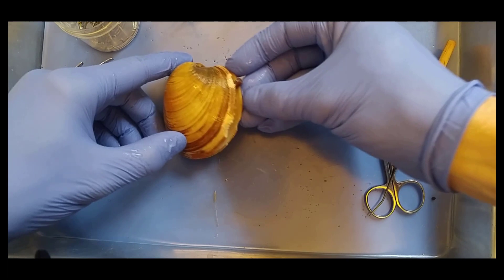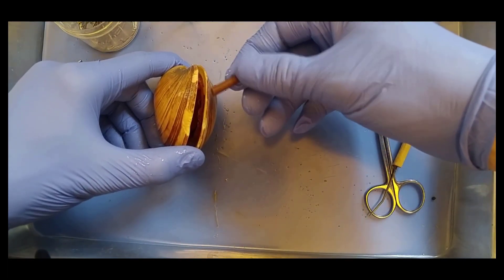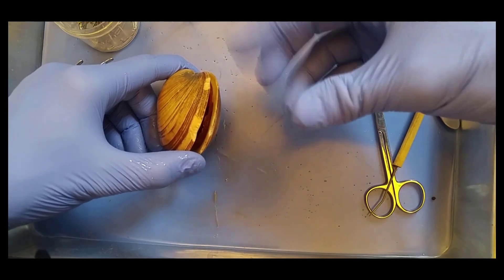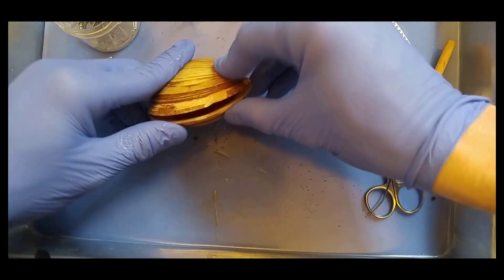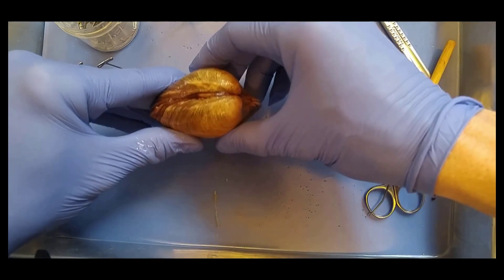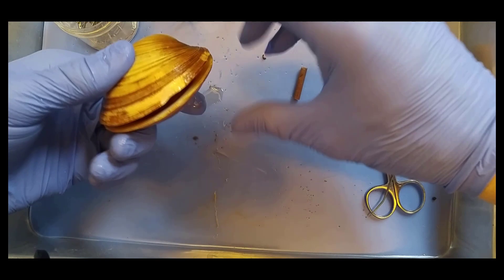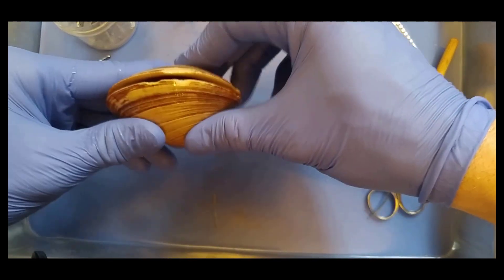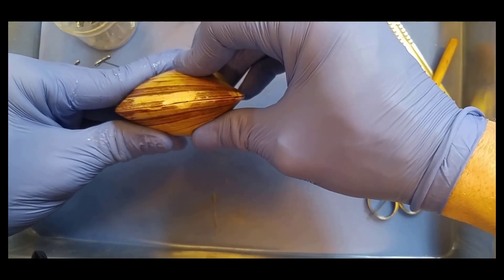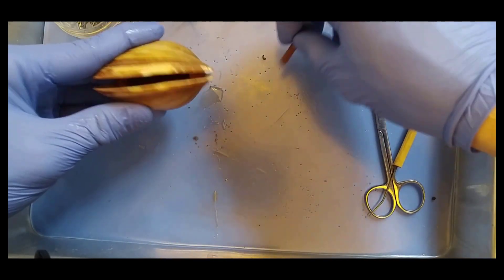You'll notice on your clams that they come with little cigars. This is actually just a little piece of dowel rod that they put in there to make sure the lid doesn't snap shut. Because these guys bury themselves in the beach, in the soil, and then they filter water in and out of their bodies. So they have really powerful muscles that clamp their shell closed, and so we put these in here so it doesn't snap shut all the way.